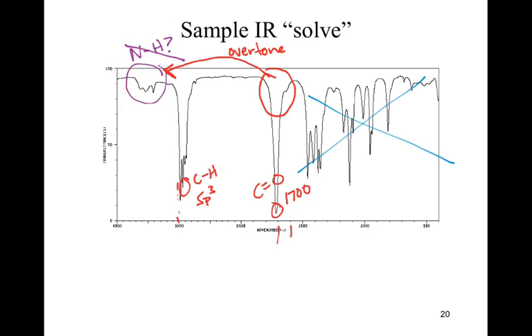The carbonyl peak is sometimes so wickedly polar and intense that the signal doubles, and we end up seeing a signal showing up at roughly double that wave number. And it does tend to carry the same kind of patterning. You usually see a fairly sharp peak and then a couple bumps coming after it. And that's exactly what we see here.